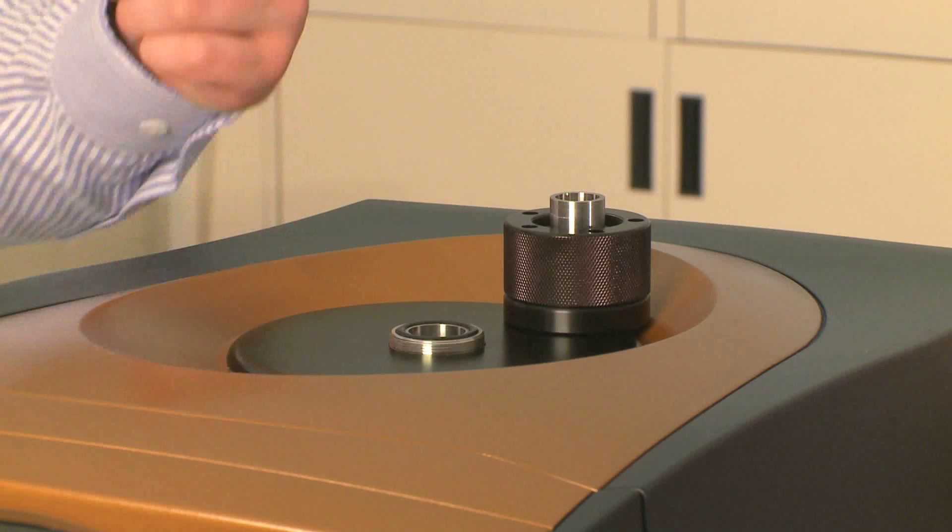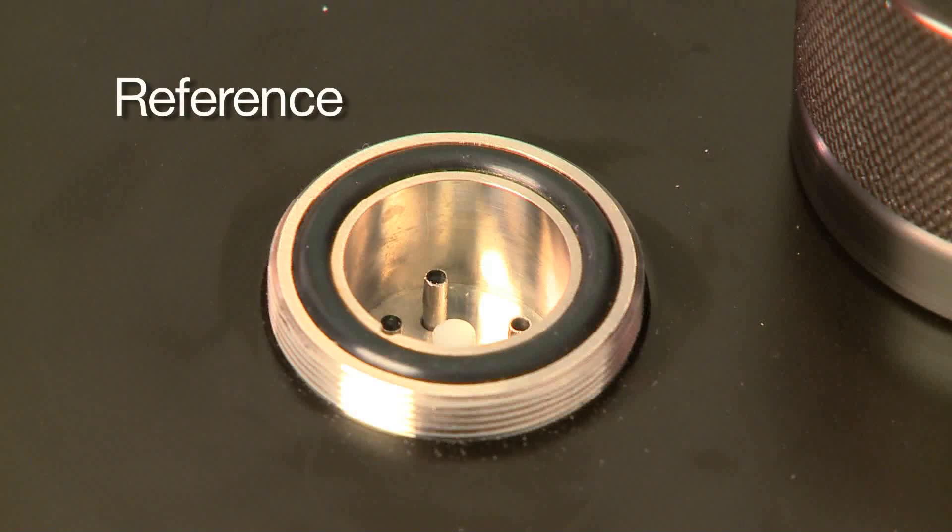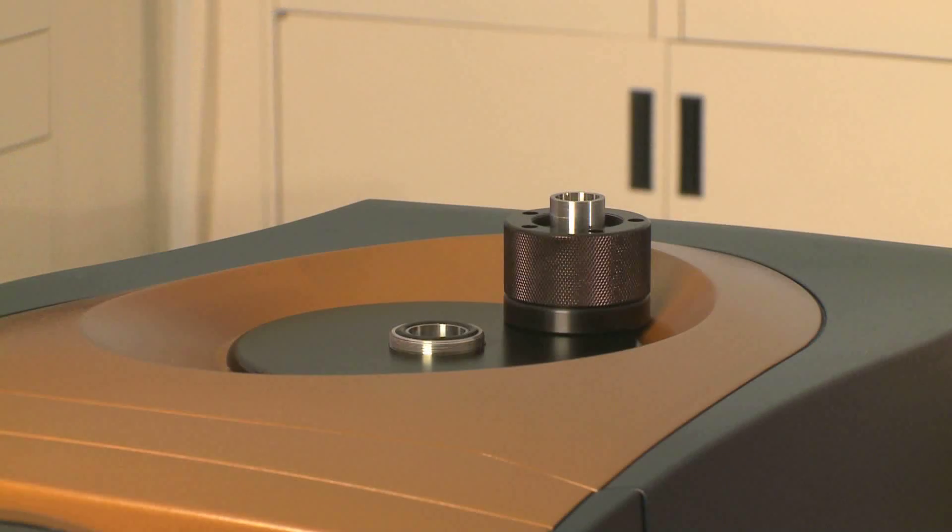You can see there's a sample and a reference side. The reference is on the left side as you're looking at the instrument, and the sample side is on the right.